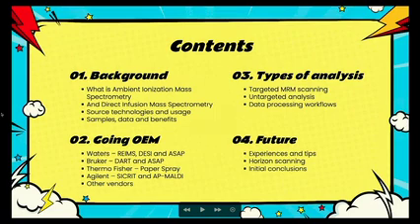Also cover a little bit about direct infusion, because most of you will be familiar with the fundamentals of direct infusion, and quite a lot of you will have done direct infusion in some way, shape or form, perhaps not realizing it. I'll talk about some of the source technologies and their usage that exist, and the types of samples that you can use, and the types of data, and the general benefits that you're going to get from going with either an ambient or direct infusion approach.